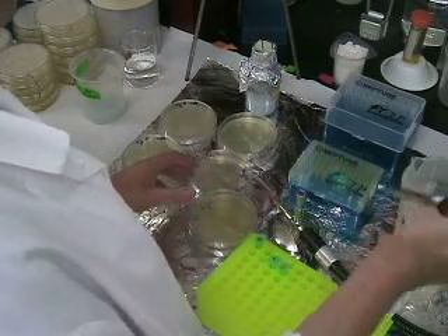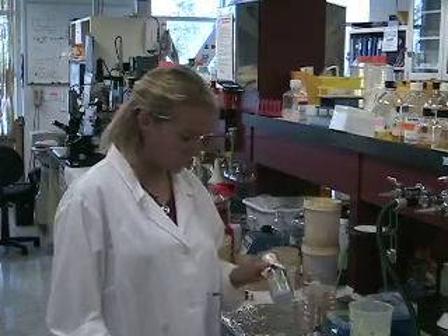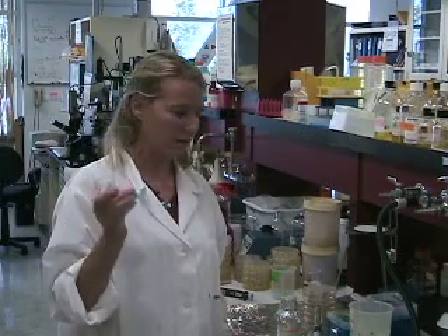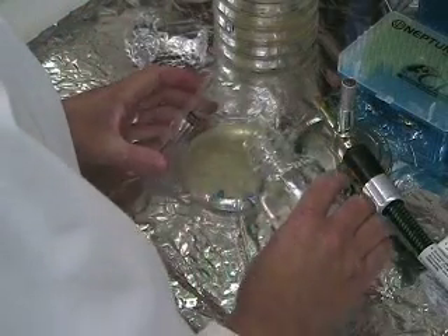So there will be two plates per sample. Now we have to spread the bacteria onto the LB plate. I'm going to use some autoclaved glass beads, but you can also use a pipette pasteur that you shape into a spreader. I'm going to pour a few beads onto the Petri dish.